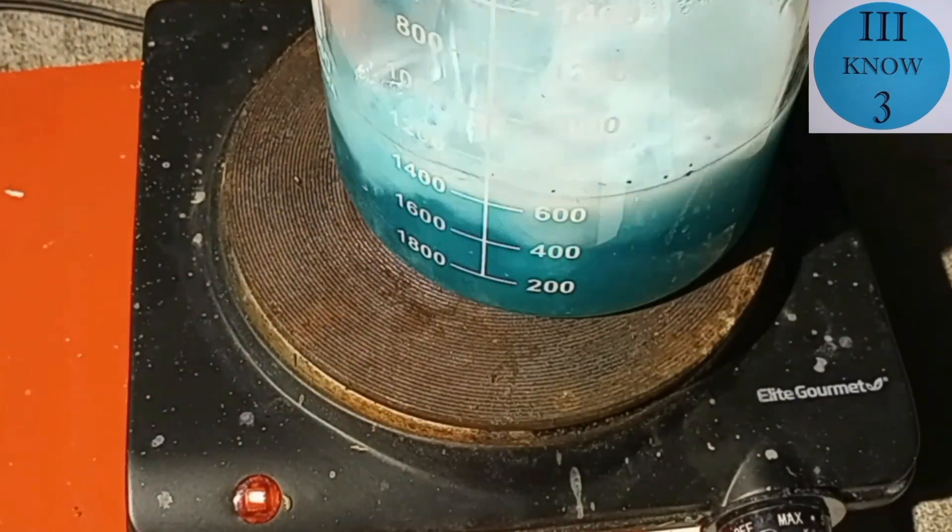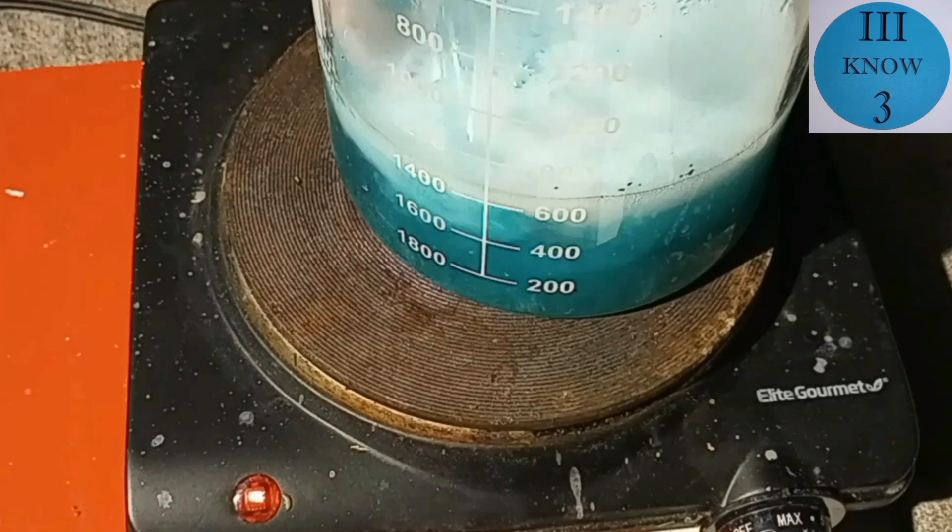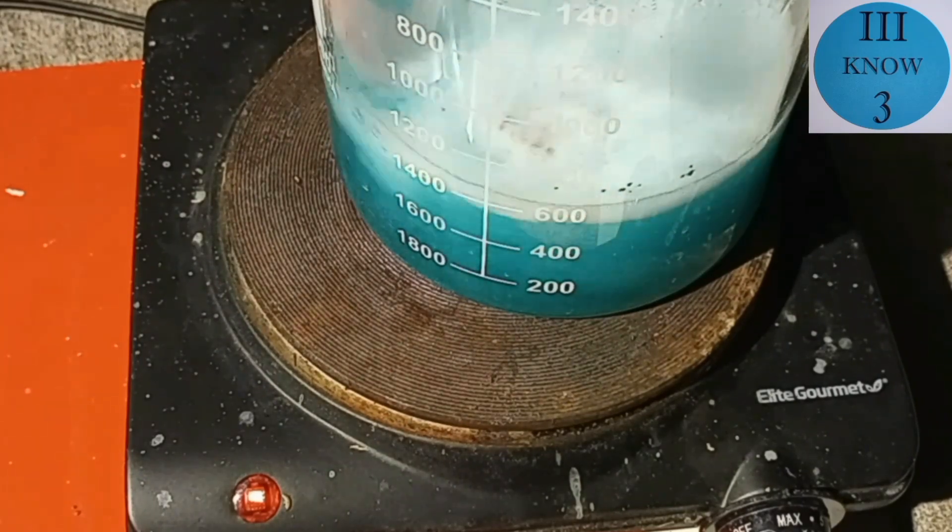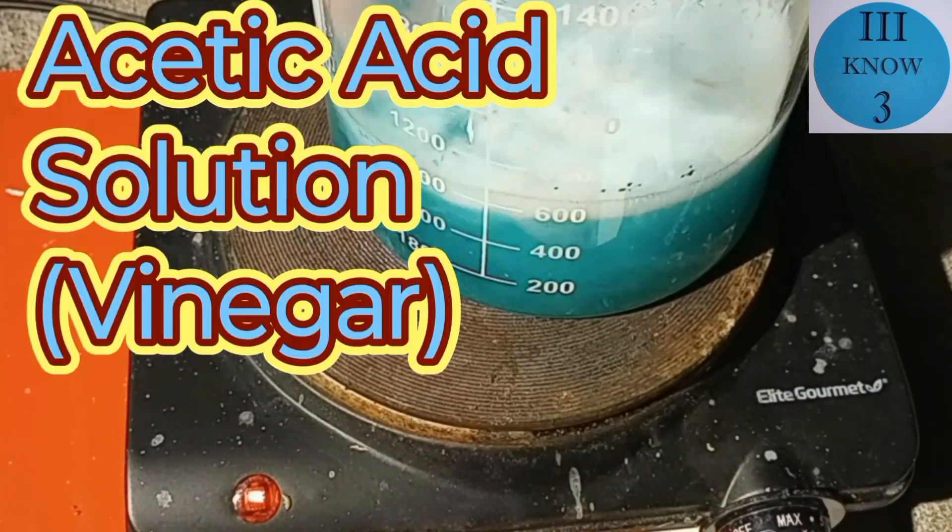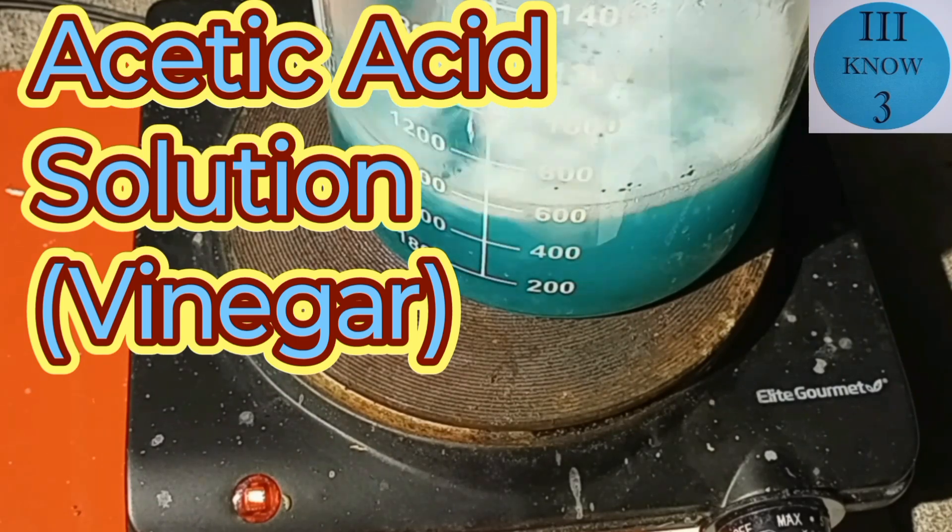A few months ago before I started making videos I made this solution of copper and nickel in acetic acid. Yes I dissolved them in vinegar.